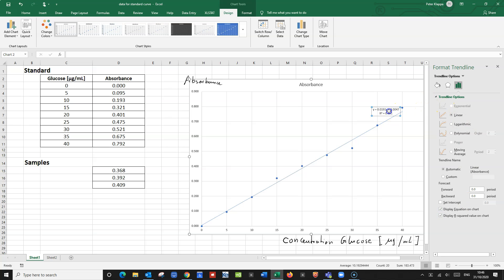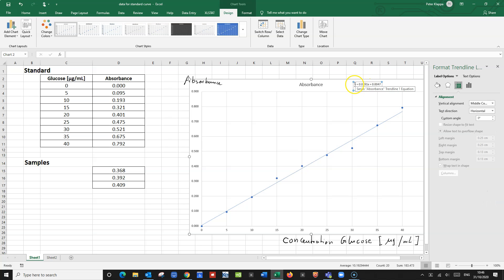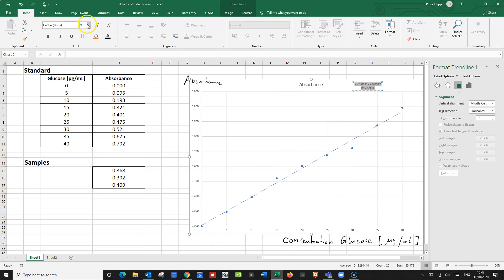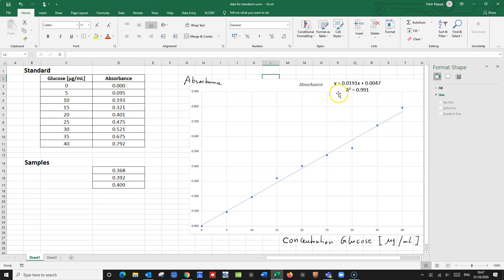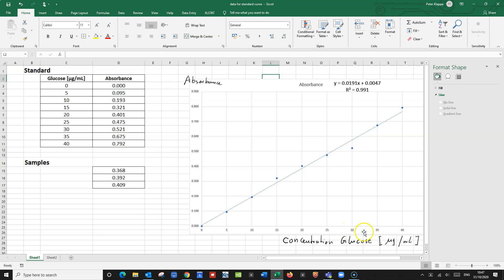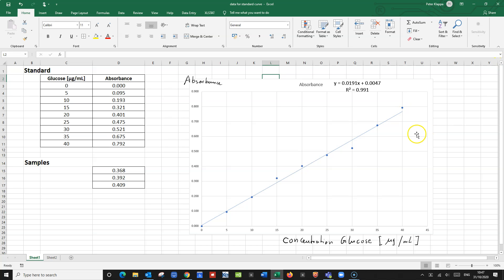We display those values and make them a little bit larger so that we can easily read them. So we've got the equation and the R-squared value. The R-squared value tells us the correlation between the x-values — our glucose concentration — and the absorbance. We've got a 99% correlation, which is pretty good. It shows that our standard curve is not too bad and demonstrates a very strong correlation.